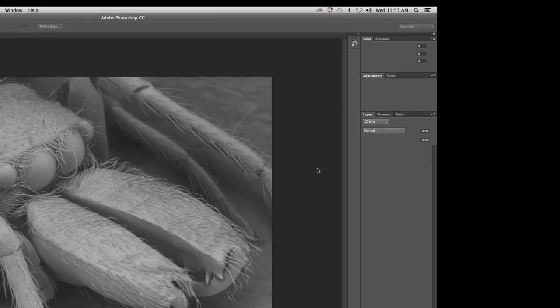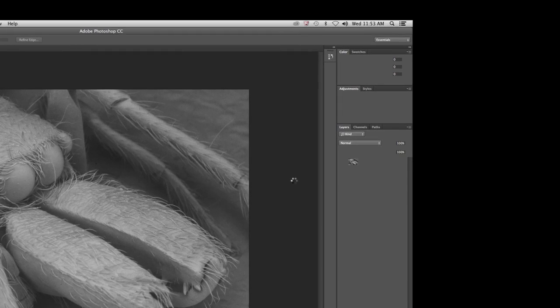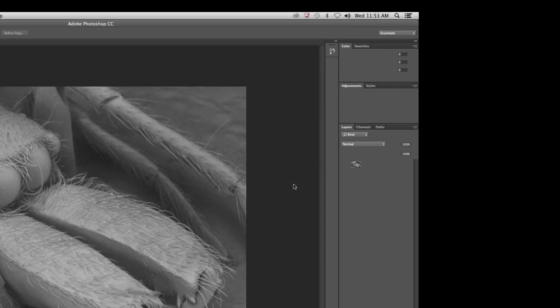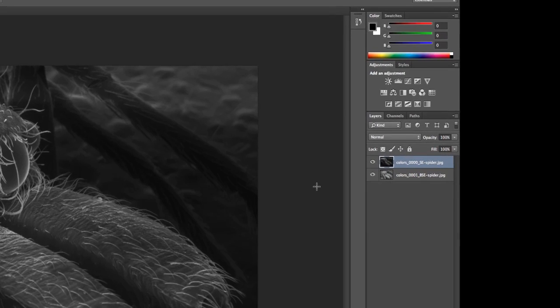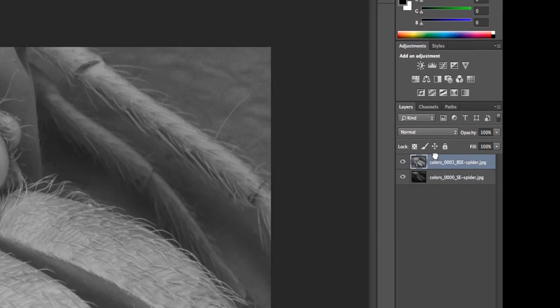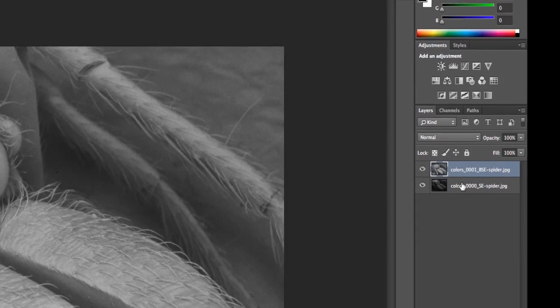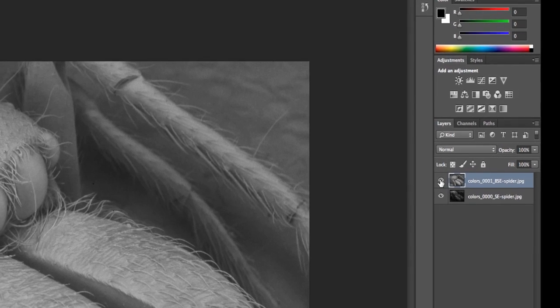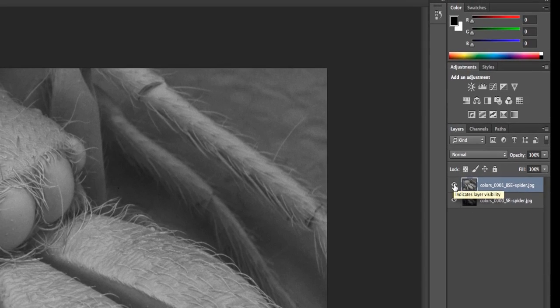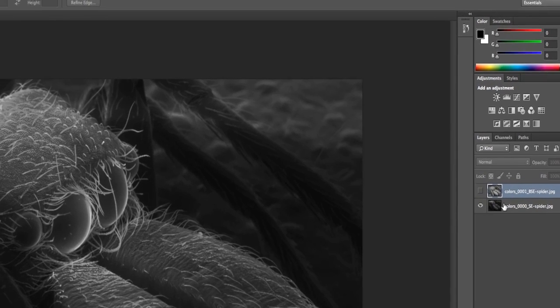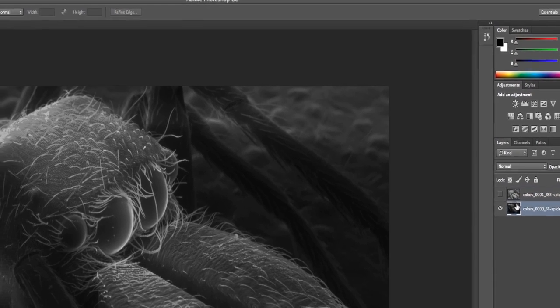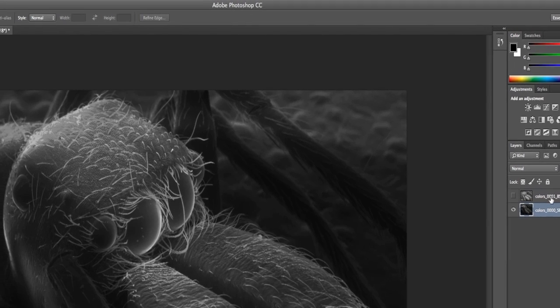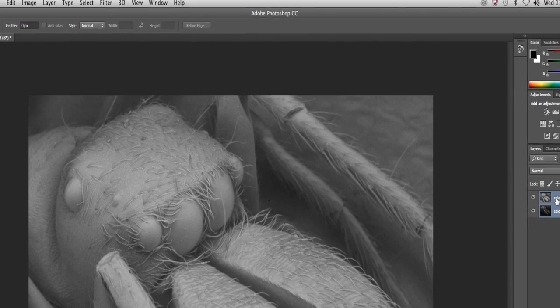The two layers, I typically, when I do this technique, I like to have the backscattered detector shot on the top, and I use the secondary electron as my base layer, so I'm going to just switch those two around. Here's the backscattered electron is on the top. I can turn this eyeball off. That makes the bottom layer visible. And the first thing I'm going to do is I'm going to highlight both of these layers, make sure they're both visible. They're both highlighted here.